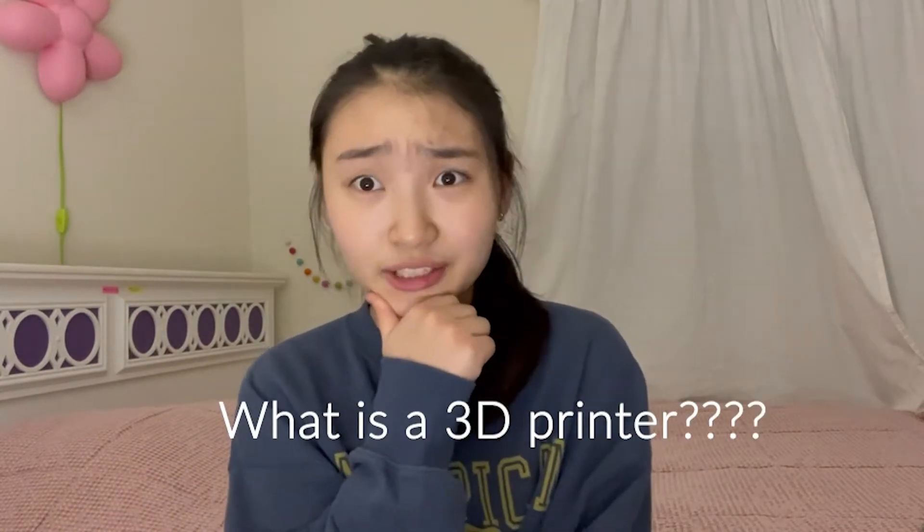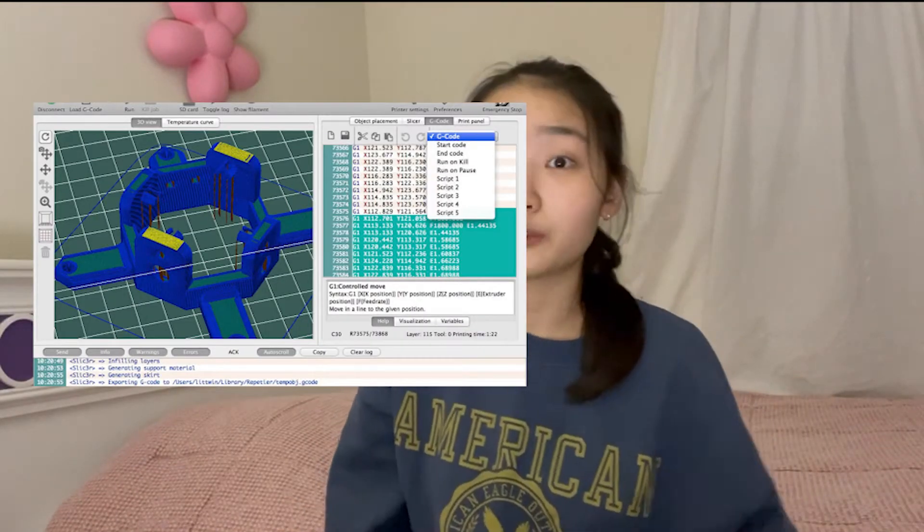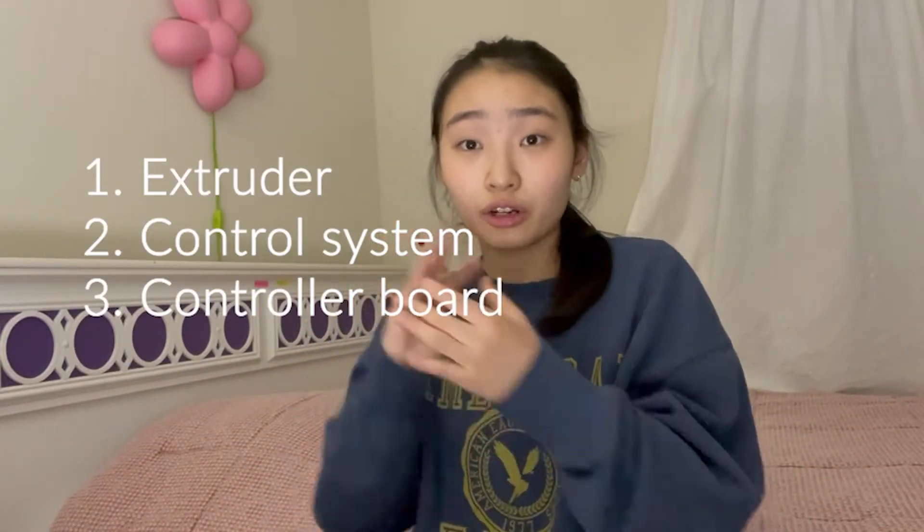First off, what is a 3D printer? 3D printers are machines that deposit material layer by layer into the 3D structure that we want. 3D printers get instructions from a series of commands written in a language called G-code. 3D printers consist of three main parts: the extruder, the control system, and the controller board.